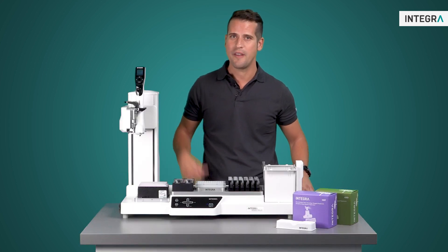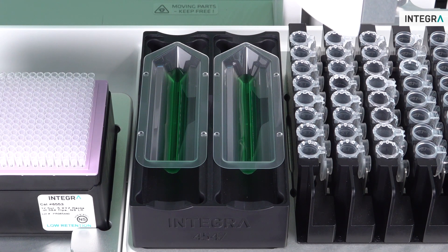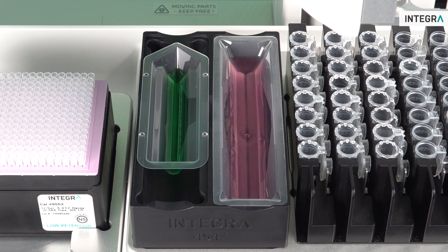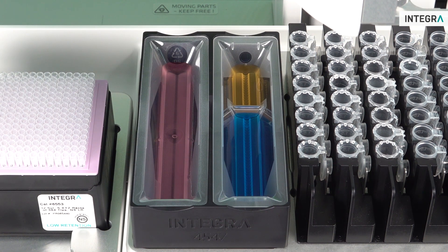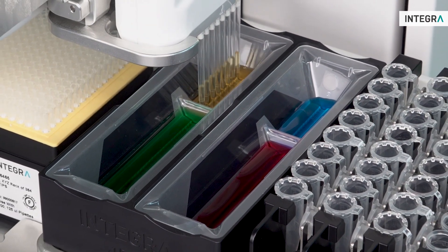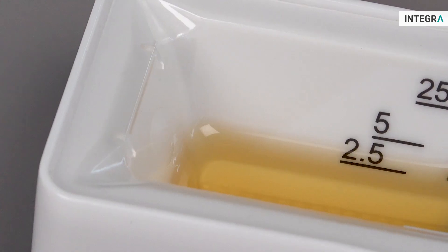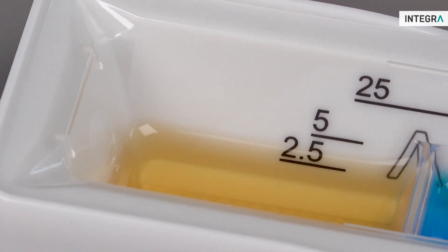These reservoirs can also be used for automated protocols with the Assist Plus pipetting robot, therefore solving the problem of dead volume for lab automation as well. The dual reservoir adapter is available to accommodate 10 ml, 25 ml, or divided reservoirs, allowing storage of up to 4 different liquids on one deck position of the liquid handling robot. This increases walk-away times, since reagent exchange can be avoided by minimizing the dead volume of reagents used.